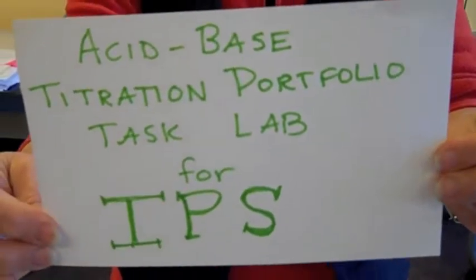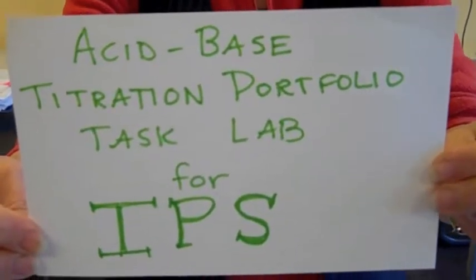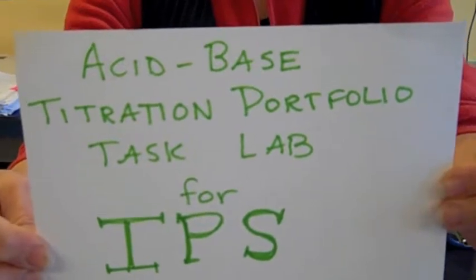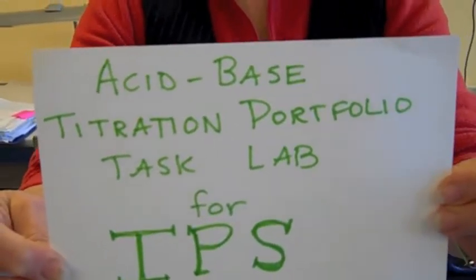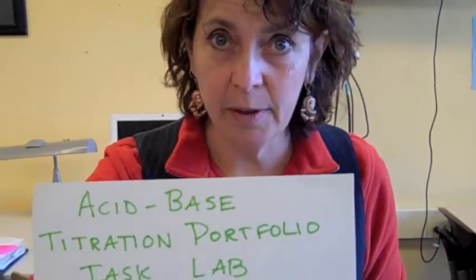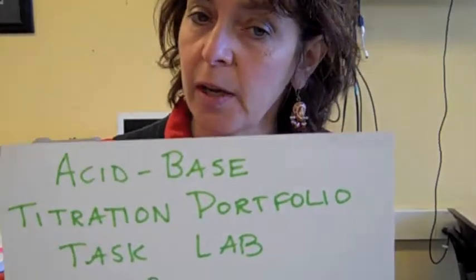Hi, I'm here to tell you about how to do the acid-base titration portfolio lab for IPS. This is a portfolio task, and it's an important lab in the freshman Introduction to Physical Science class.